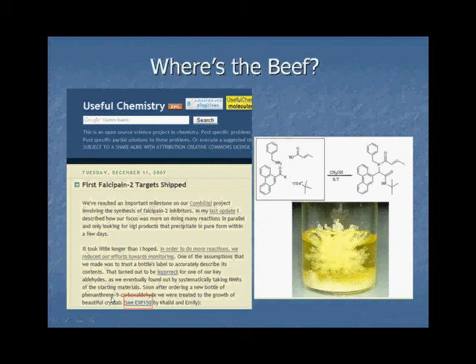And I'm talking about all kinds of things. And here I'm linking to experiment 150. Now this is actually a link to the wiki that is the lab notebook of how this compound was actually made. All right, and so where I'm talking about this compound here from this Ugi reaction. And here's a nice picture of a crystal of it.